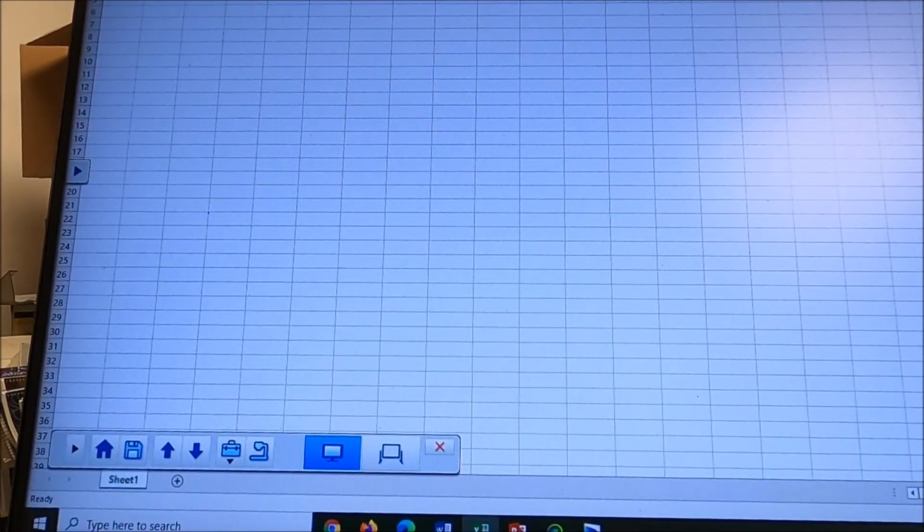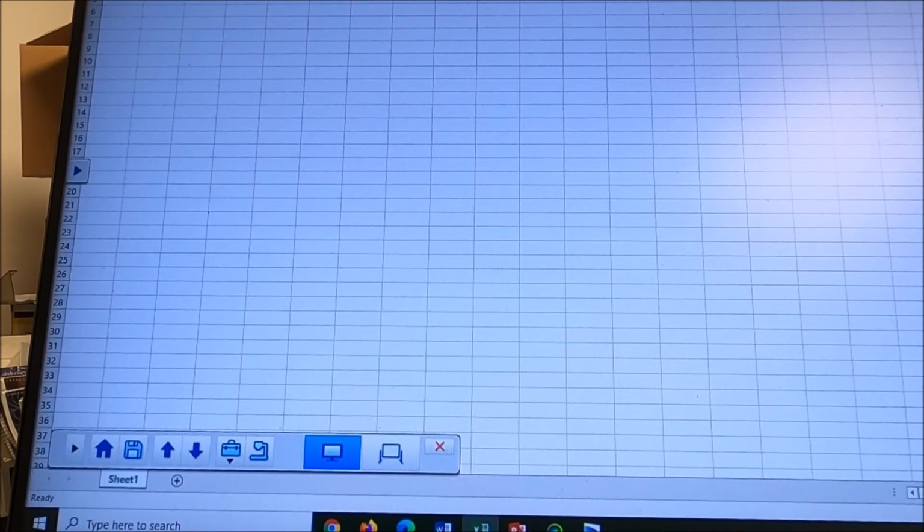Okay, guys, we're going to put our concentrations in the first column. Well, the first solution, pure water, has a concentration of 0. Now I'm making up data points. So let's say we have a 3 molal solution, and times 0.52 gives me 1.56 here.